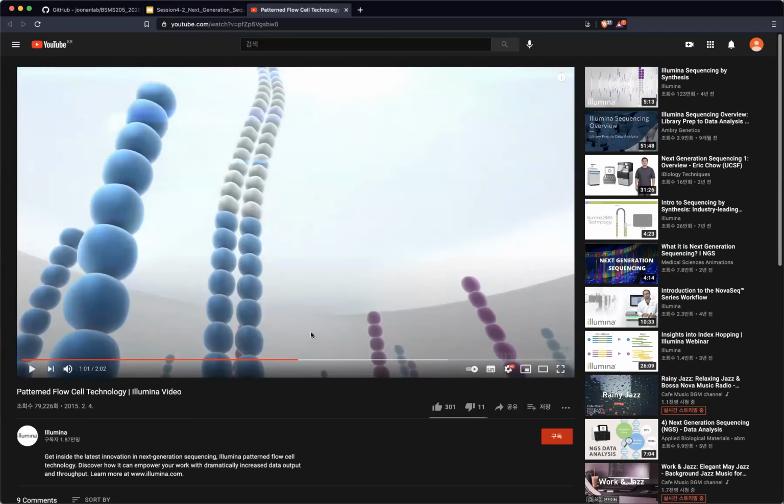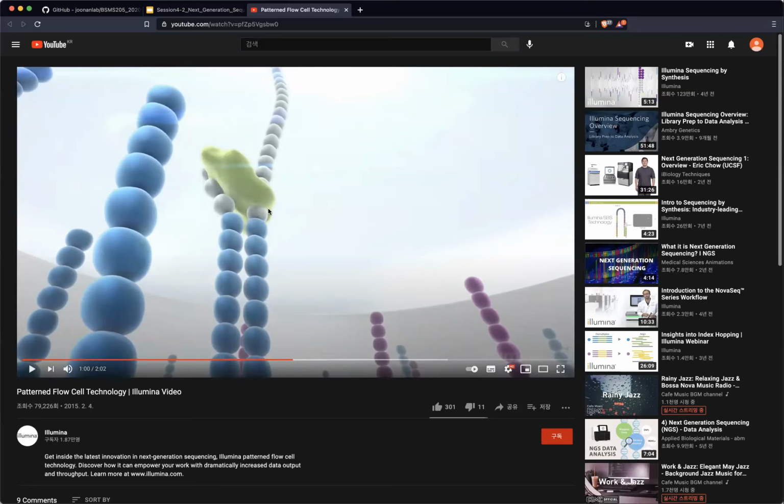Synthesis means that based on these templates, where the template here is your DNA library sequence, if this is, let's say, an A, then your primer is going to bind to T because this is the complementary nucleotide, right? Then if the next base is probably C, it will bind to G, right? Then you have the individual synthesis for the positions, right?